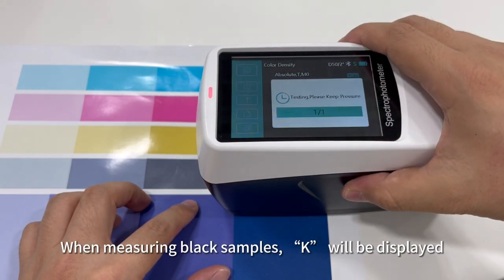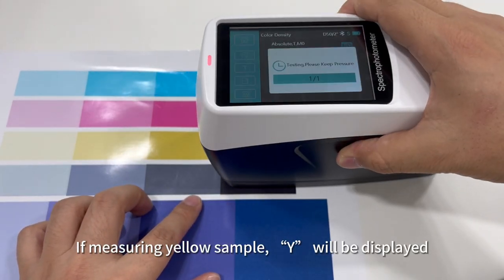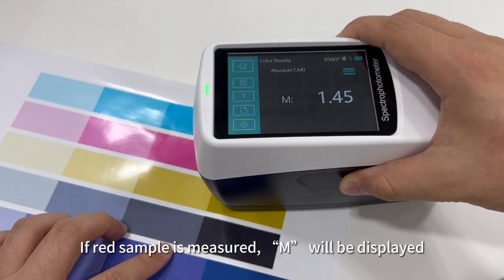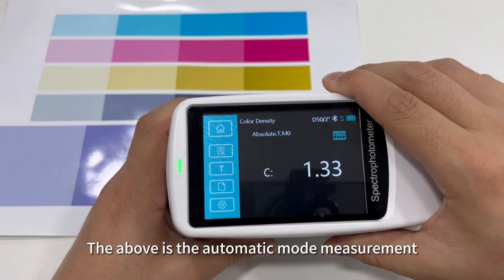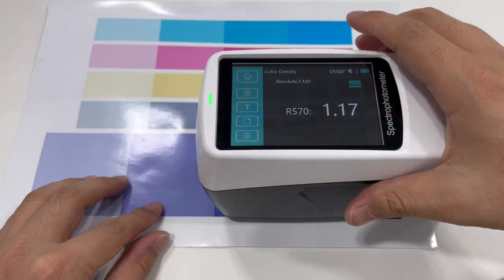When measuring black samples, K will be displayed. If measuring a yellow sample, Y will be displayed. If a red sample is measured, M will be displayed. When measuring blue samples, C will be displayed. The above is the automatic mode measurement. Spot color density measurement.